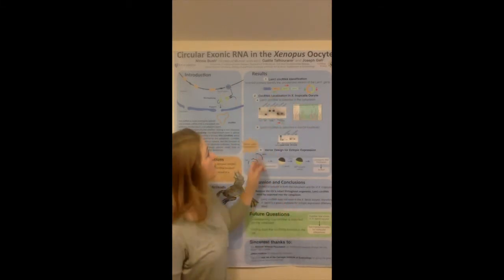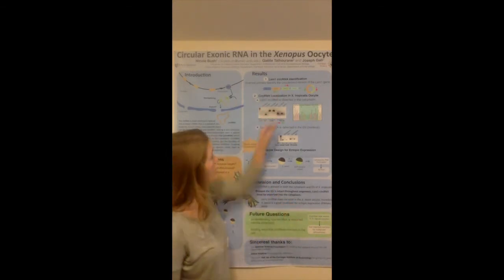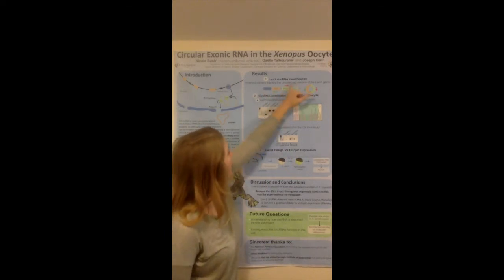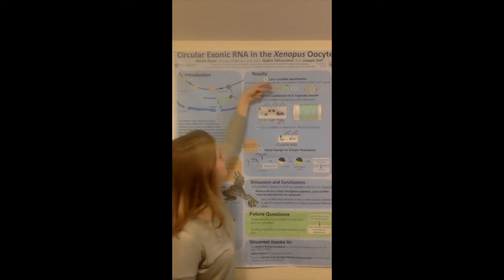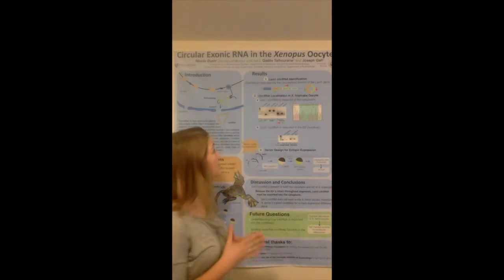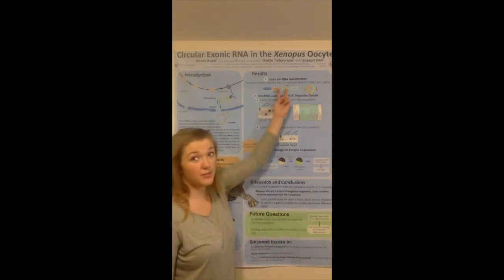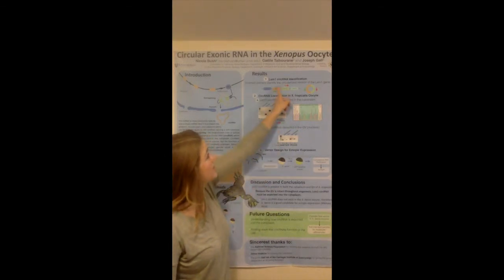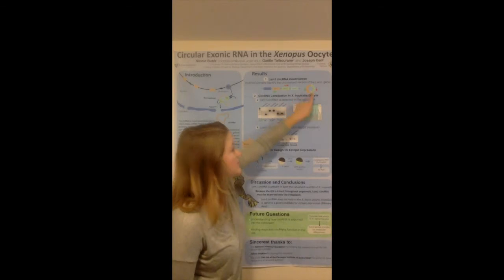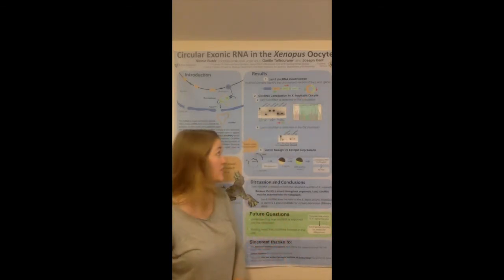the gene. So normally when you want to get an RNA product of a gene, you'll make your primers face one another. Because when each primer creates its strip of DNA, those 2 strips will anneal to one another and you'll get a product that cannot be degraded. So what we did instead of creating inward-facing primers is we created outward-facing primers. The reason we did this is because when these 2 exons circularize, you'll actually end up getting a sequence of this novel exon-exon junction that would never occur in the linear version of the protein.